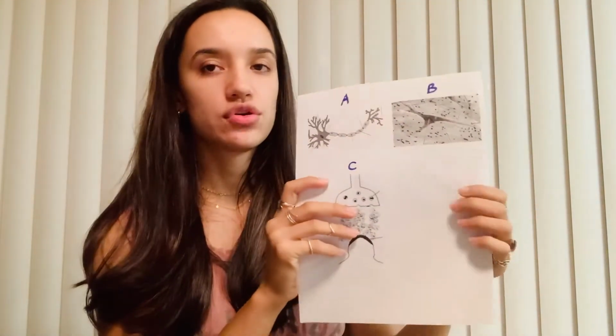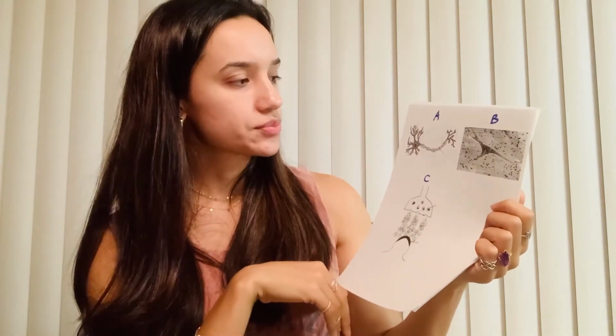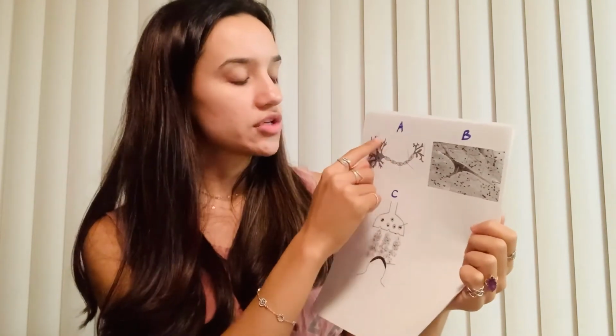Next, we have nerve tissue. Nerve tissue starts with the neuron, which is this structure right here. We have the cell body, also known as the soma.